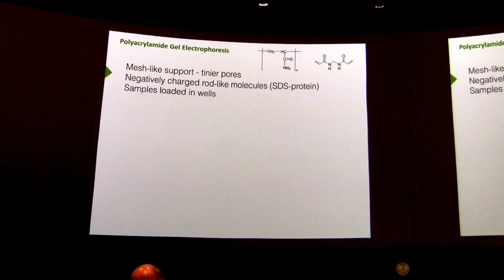number one. Number two, this may surprise you, but it happens. The SDS arranges itself as a sort of a shell around that protein rod. The nonpolar part facing the polypeptide chain, and the negative charge, SDS, like most detergents, is negatively charged at one end, the negative charge sticking out. Well, what have I just described to you? I've just described a rod that's coated with a negative charge. And the longer the protein is, the more SDSs I'll have, and the more negative charge I will have.